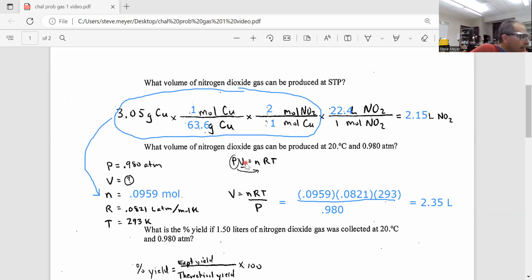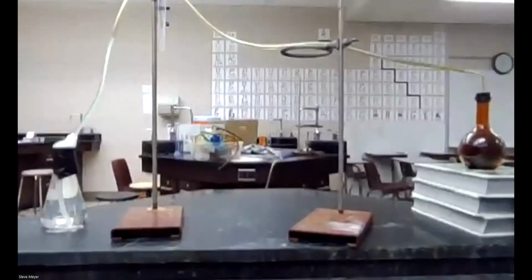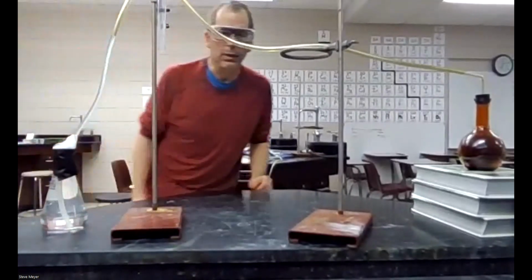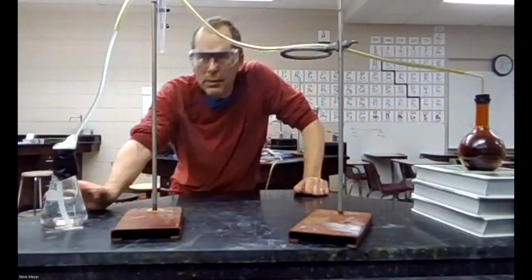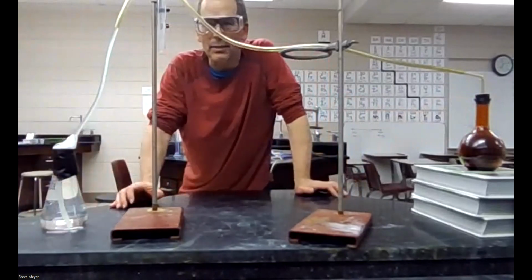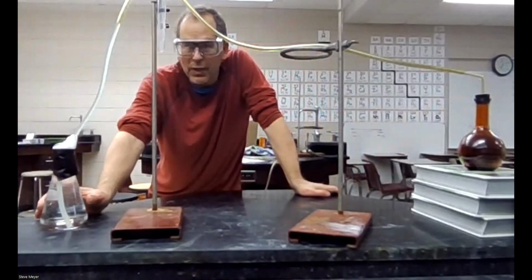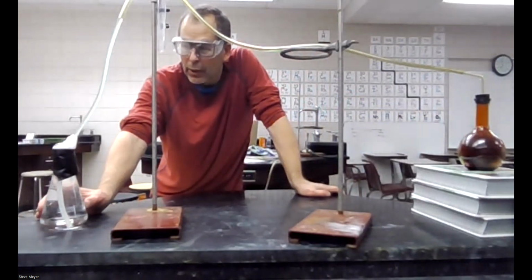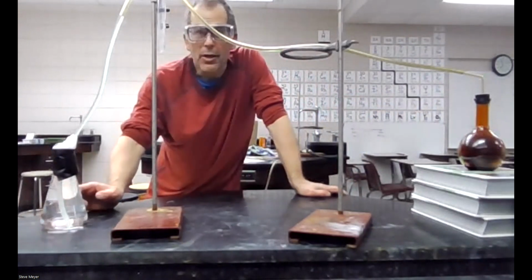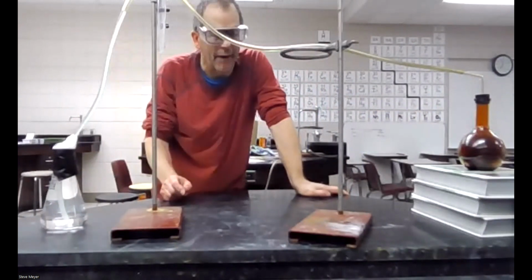We got to go back to the last act here to our experiment. So I'm going to stop the share, and I'm going to turn this around, and we have something going on here with our experiment. Let me see if I can line this up so you can see it. That's pretty good. So notice this is all red over here, and this is cleared up. So this NO2 gas is actually acidic, and there was a base in here, which is pink in the presence of phenolphthalein, and the acid, kind of like acid rain, turned it to clear, which would be acidic or neutral.